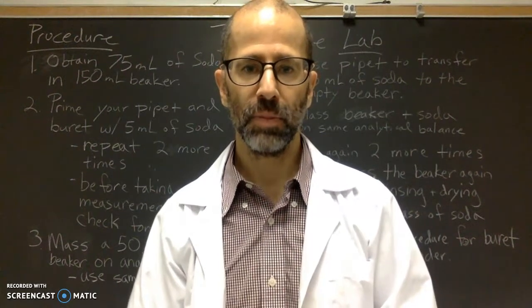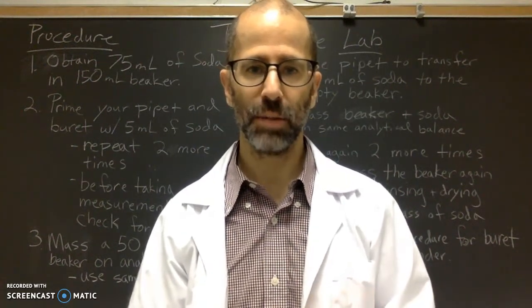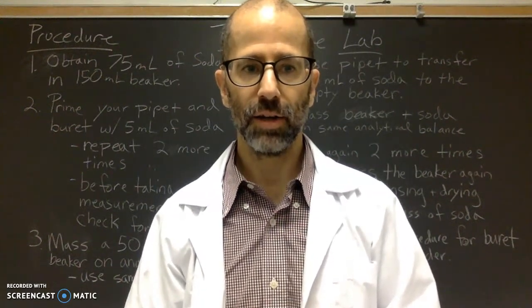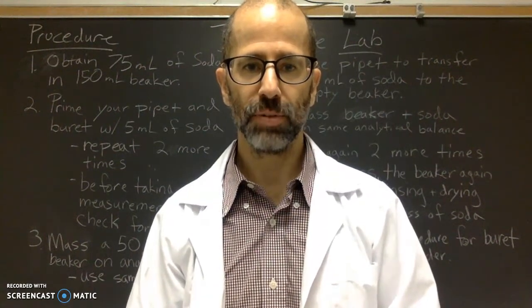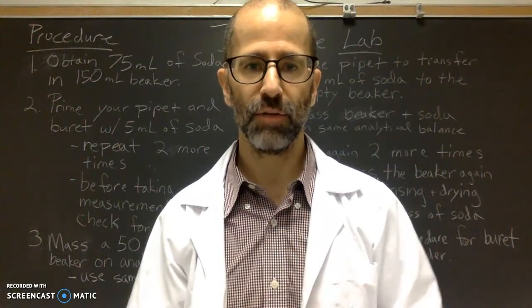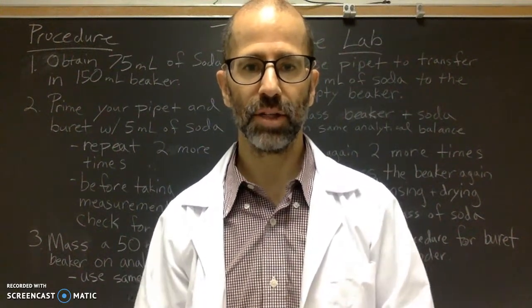The procedure is pretty quick, so if I ask you to do it again, it's not going to take you that long. But you don't really want to repeat anything. So make sure that you're doing the correct procedure, because I will make you repeat it if your densities are off, because it's important to get good class data that I'm going to share with you.